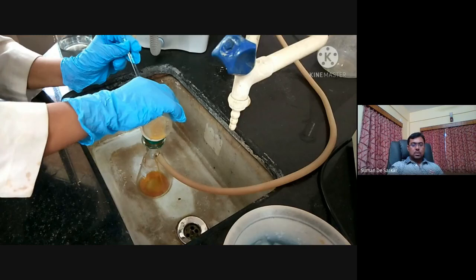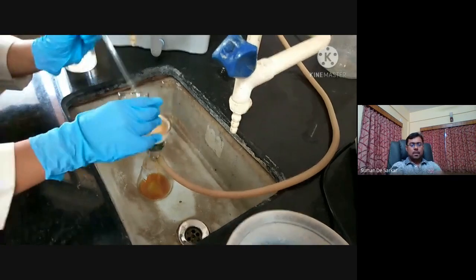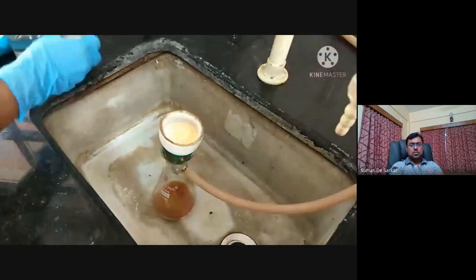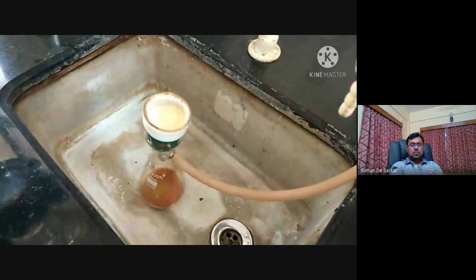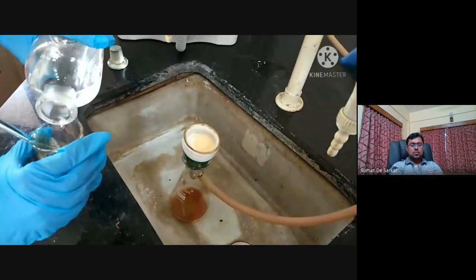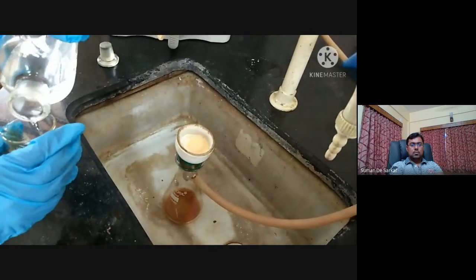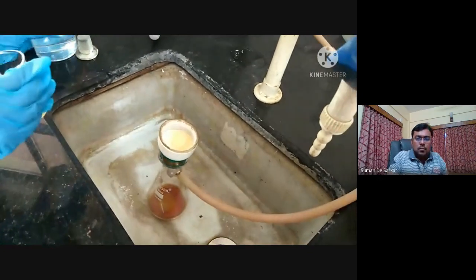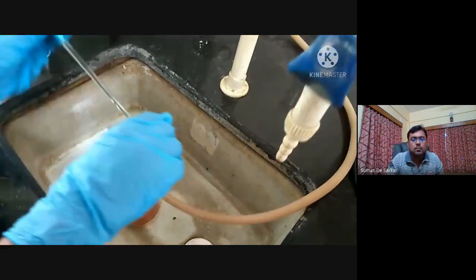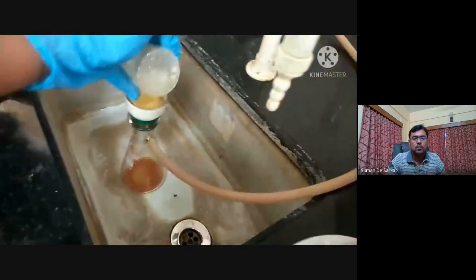Okay, so we are doing the filtration here, routine filtration. Let us continue. After the precipitation, we are doing standard filtration, and as mentioned in the instructions, we are washing it with cold normal HCl just to remove the unreacted hydrazines.